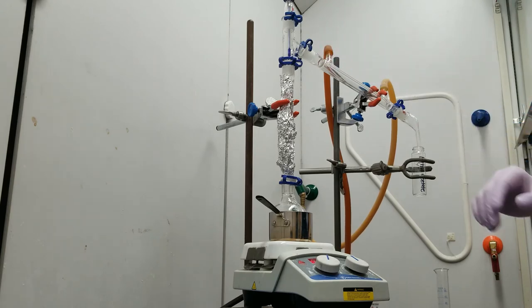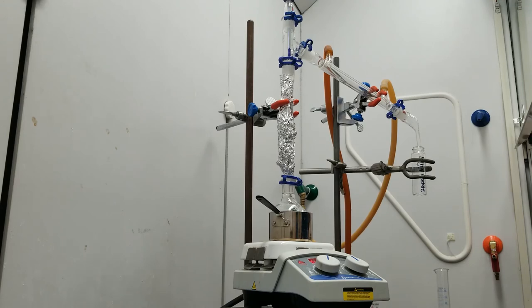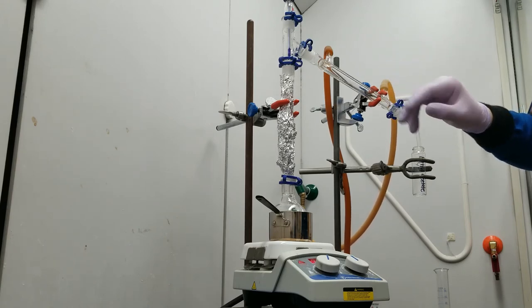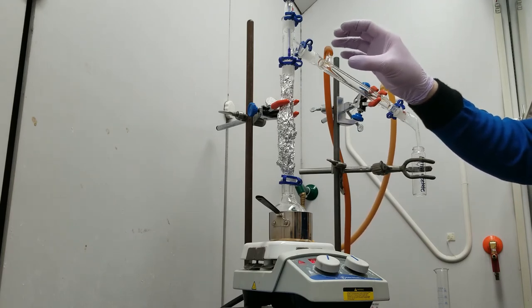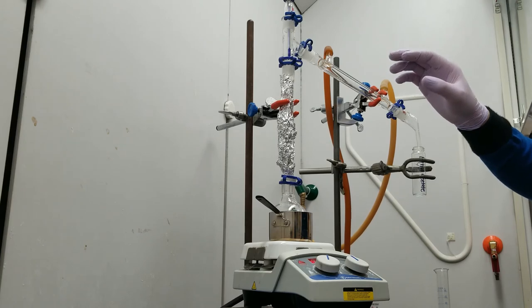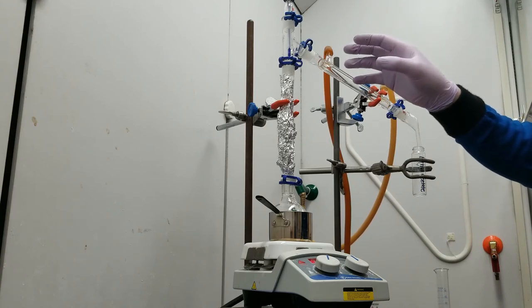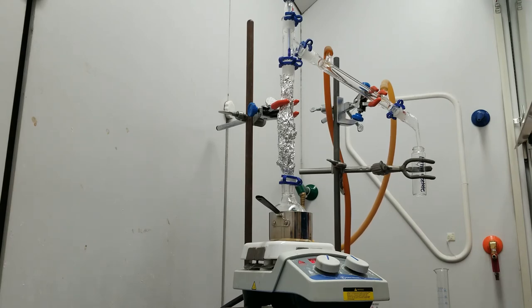But just to be ready for when the vapors are ready to come over, I'm going to go ahead and turn on my water. That's just hooked up to a hose back here. And I want enough water flow that the glass is completely filled. I've got the occasional bubble here, but the whole surface of that inner tube in the water jacket condenser is being cooled right now. So I have enough water. I can turn it up later once I actually start seeing fumes hit it, because I'm going to need to cool it as the fumes warm up the system. But this is perfectly adequate for now.